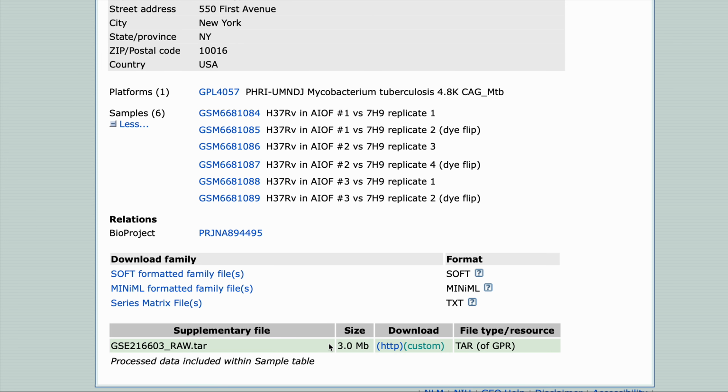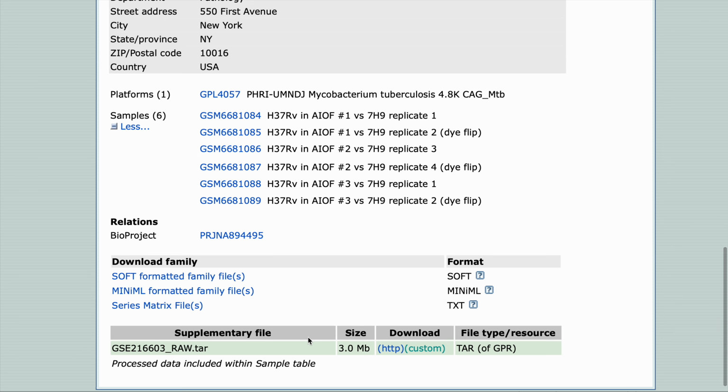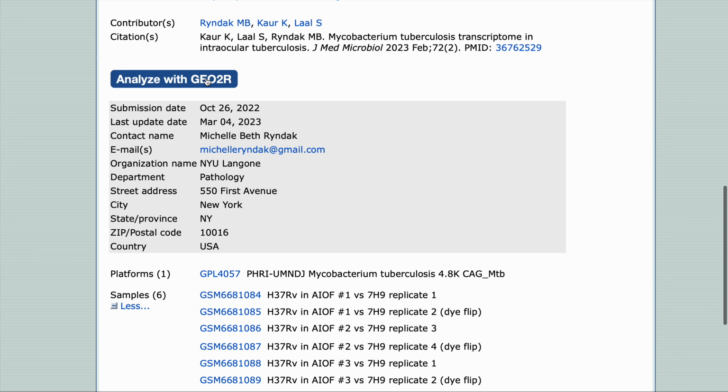But if you download it and double click on it, you will get the whole file on your side, and using that you can analyze the data using the Galaxy server, and also using R or Python. Also the regular NGS data analysis pipeline that you follow: initially doing quality control, then trimming the adapters, and then doing all of the stuff like alignment and so on. Then you land up at the final step, that is your gene expression quantification. Here you don't have to do anything. All of the things are automated, backed by R. So R will be doing the stuff for us. We just have to define the groups.